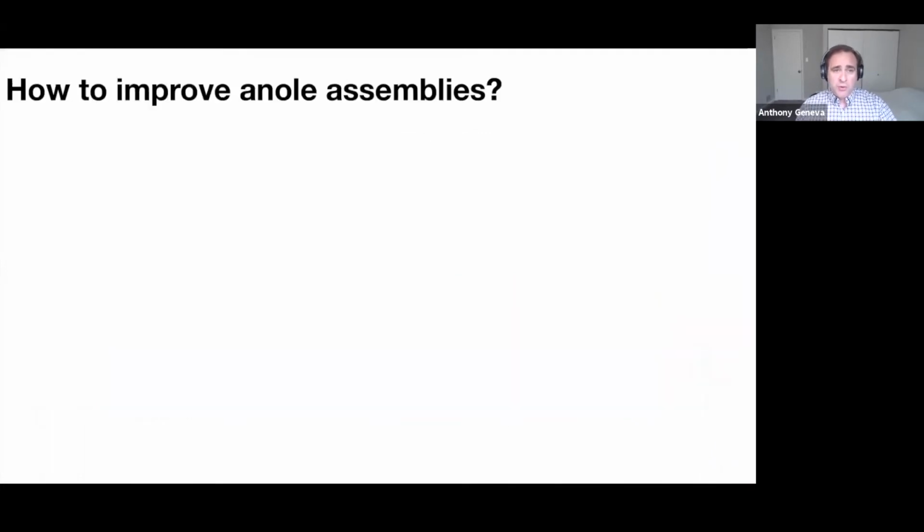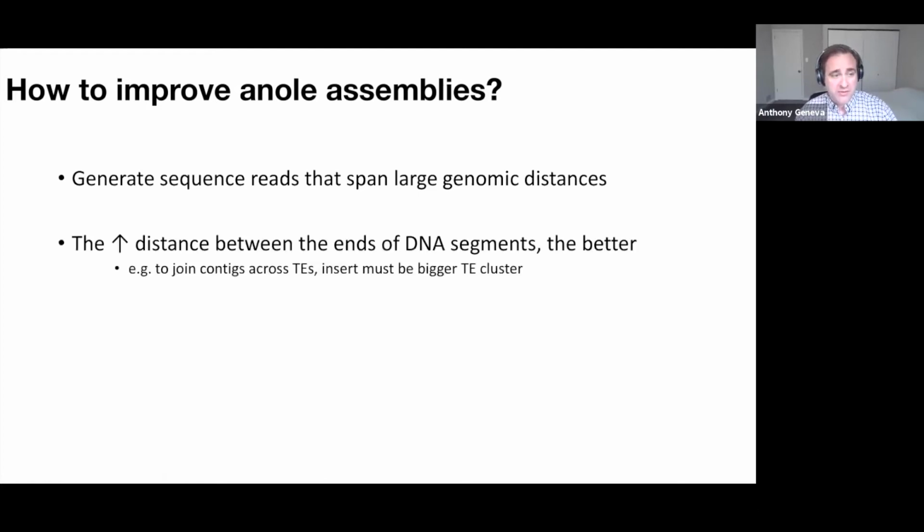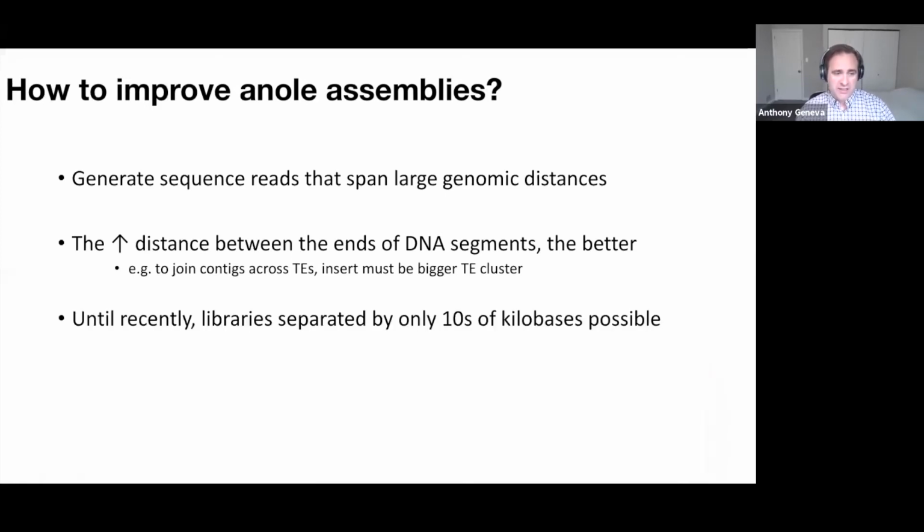How do we improve Anolis assemblies? How do we get back up to that Carolinensis bar that has been set for us? We have to use different approaches. We need to generate sequences that span large genomic distances, to be able to get across these chunks of repetitive DNA. The greater the distance between segments, the more capable we are of spanning a particular TE cluster.